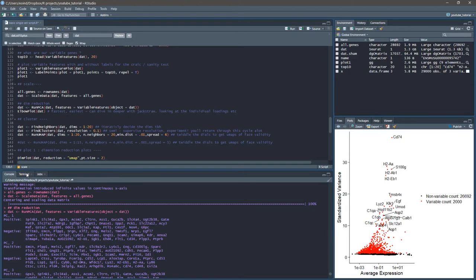The vignettes that Seurat provides have various ways of exploring that number. It's generally going to be between 10 and 20, and in every data set I've looked at, about a dozen or so single cell data sets at the moment, it seems not to make a massive difference, so experimentation is one way to do it.